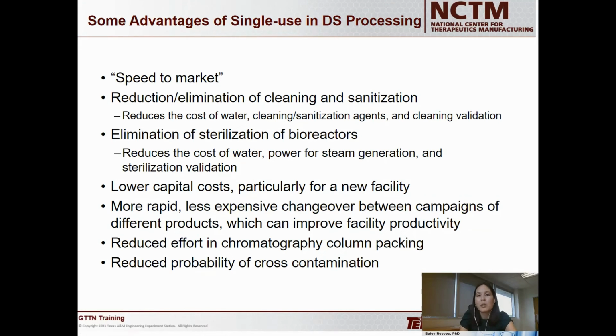You're also able to usually turn around equipment faster because you don't have to clean and sanitize anything. You just throw away the old flow path and get a new flow path or bag or whatever it is that you're using. And that reduces your turnaround time for equipment.